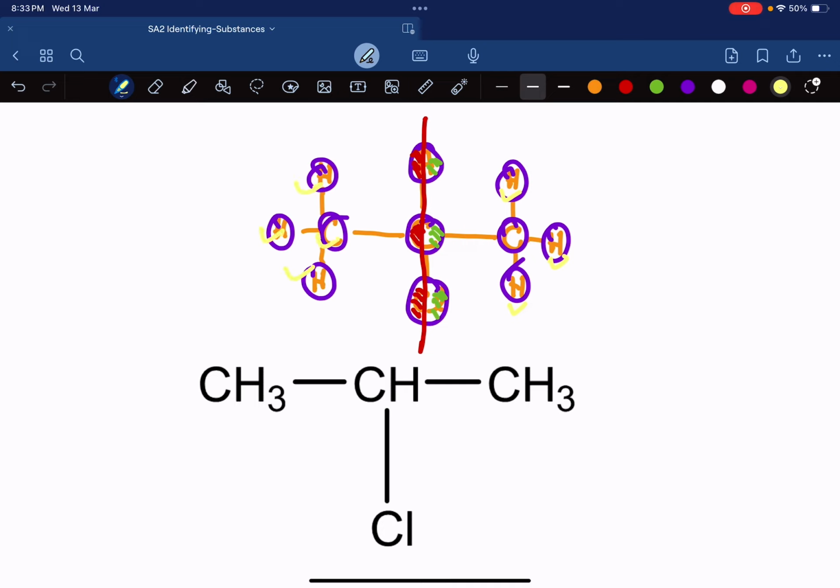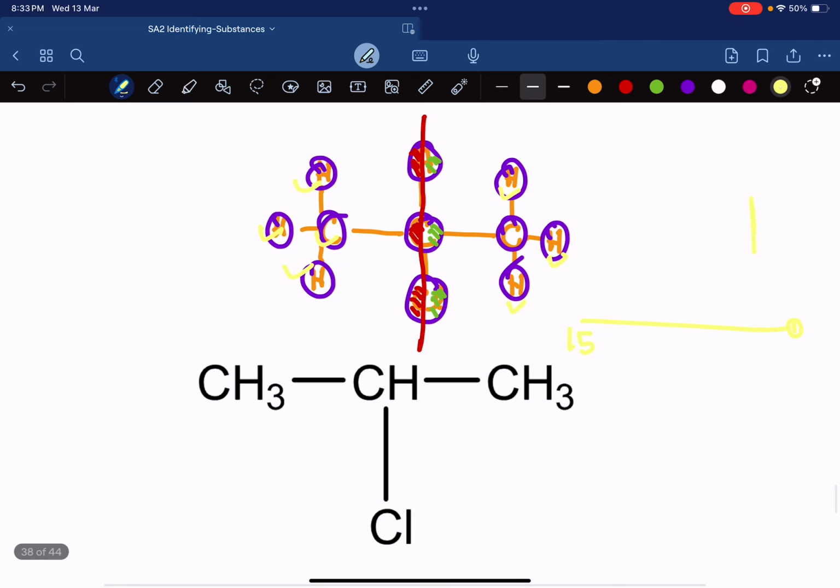Which means that on a scale of 0 to let's say 15, okay, this is what we did earlier, you get one signal that is like 6, and then there is only one hydrogen here. This is a chlorine. So you get one very small line here. Something like that. So you'll get two signals, only one signal very tall and the other signal very short.